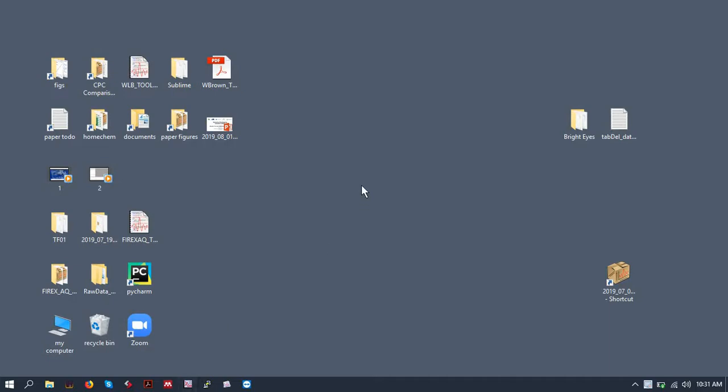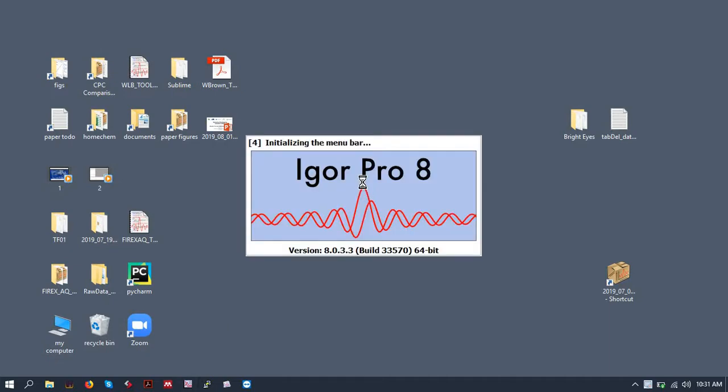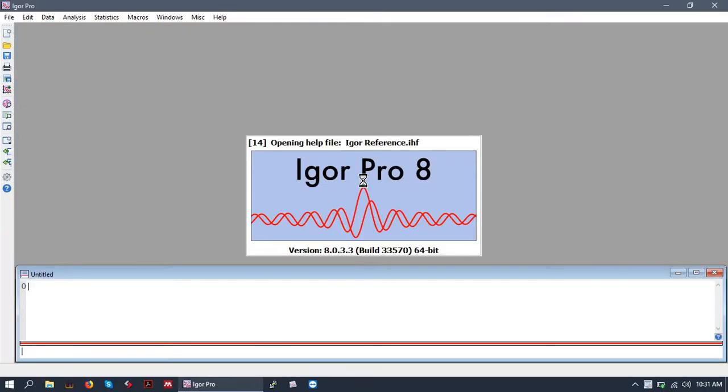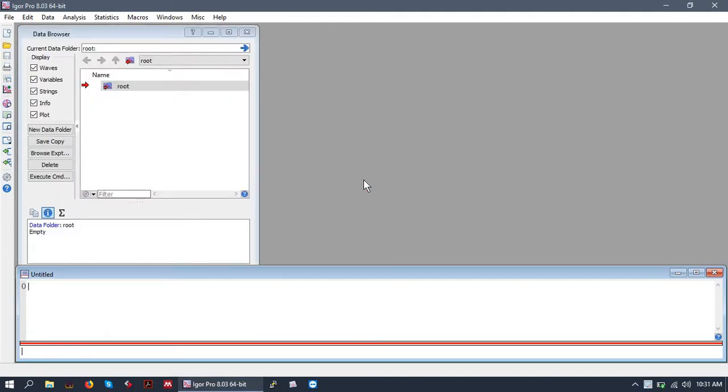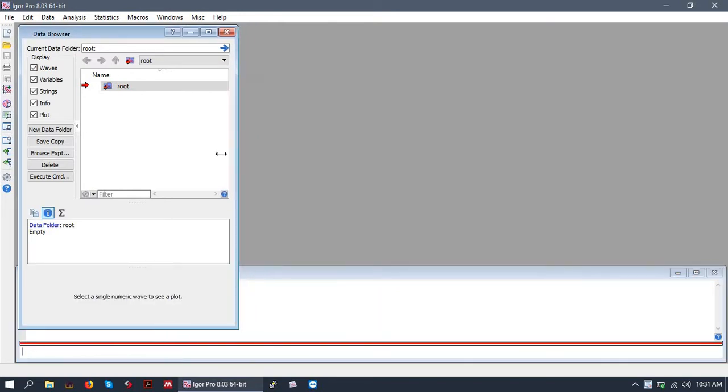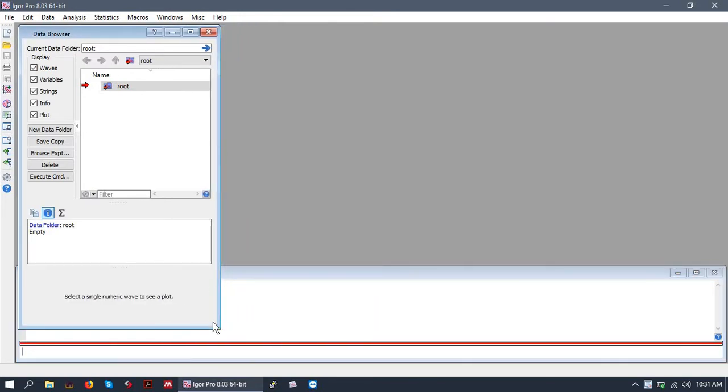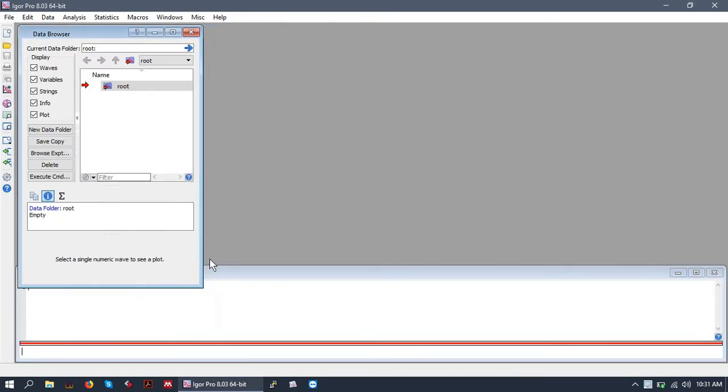Alright, let's open up a blank Igor experiment. I'm using Igor Pro version 8. You should not have very much trouble if you're using 6 or 7. Some things might be a little different, so pay attention, but they're not horribly different.